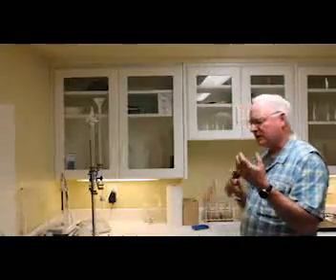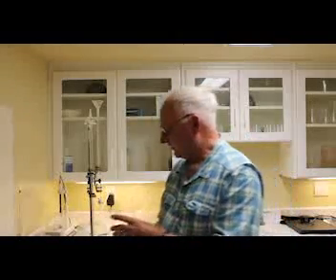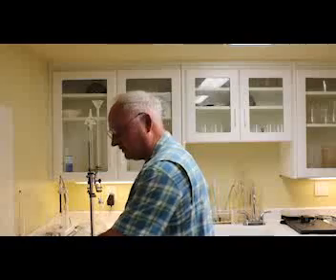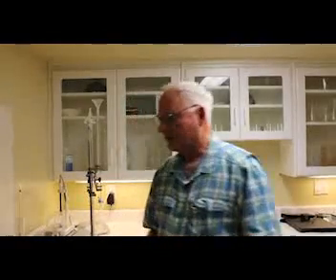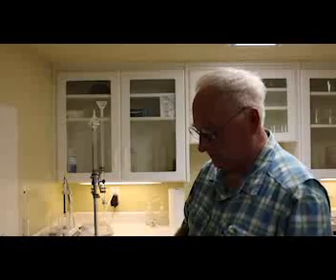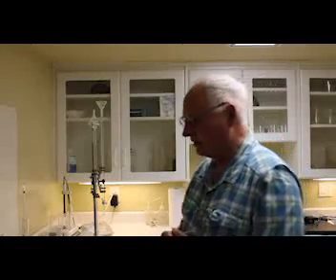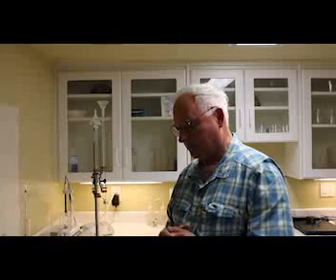Suck a little over my tongue, and then I can tell a little bit more about whether the VA is too high or not high enough in the wine. But so far the sample's tasting very, very good. So we're letting our cash still run here, and we're just about up to about 50 mils, so we've got a little bit of time to go yet till we get a 100 ml sample.